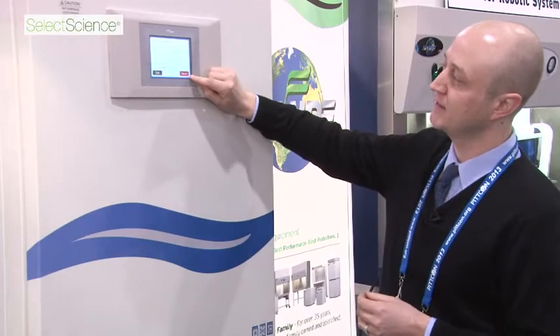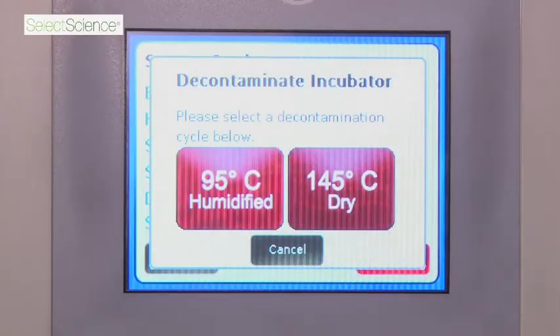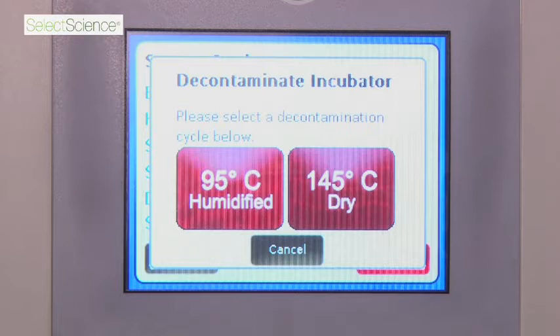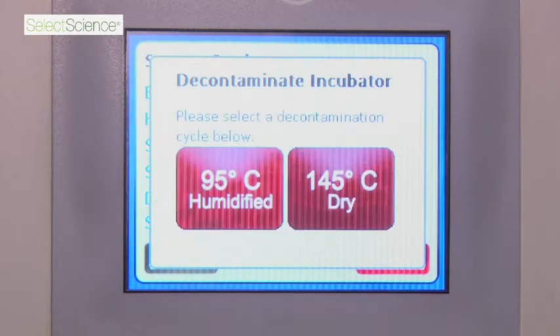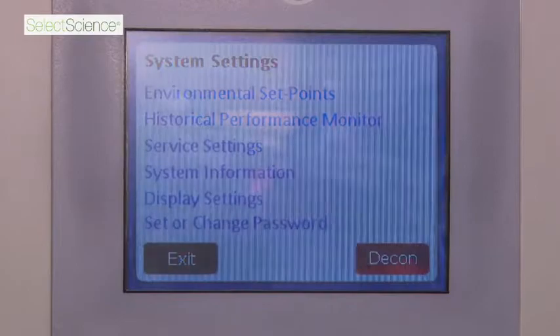The last feature is your decon sterilization cycle. It gives you two options. The interior of the chamber will heat up to 145 degrees Celsius dry, and it runs about a 10-hour cycle — a very nice overnight procedure. You can put it on a delay so once you leave for the night it will turn on and operate by itself. The humidified option is where you leave water inside the water pan, and it heats up to 95 degrees Celsius humidified, which is about a 14-hour procedure.